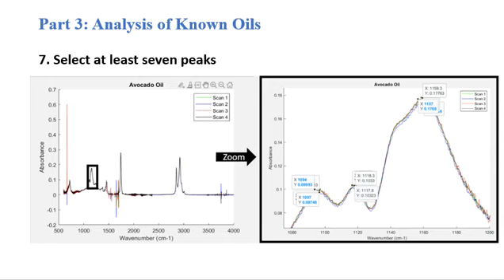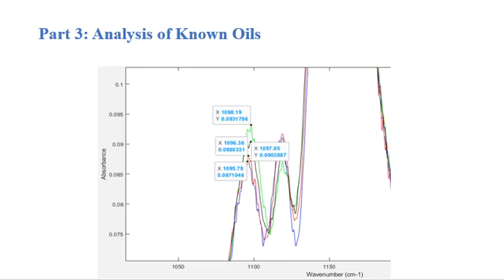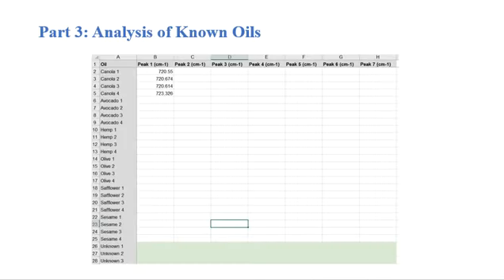See the highest, and you can see 4 lines representing each scan, and then you note down the highest point of each scan. Do the same way for the 6 remaining peaks, and then you transfer the wave numbers into a single Excel spreadsheet. The result looks like this.